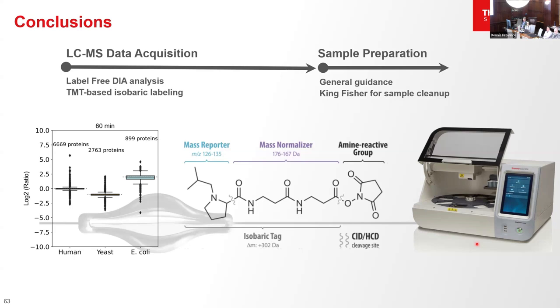Now, granted, when you're identifying 10,000 proteins, that's the last thing you want to do, go through and look at all of these, but you have the ability to do that, and I think that's true for the validation as well. And I think one reason the correlation's probably not as good is that some of the antibodies are likely raised against proteins with some specific PTM fingerprint.